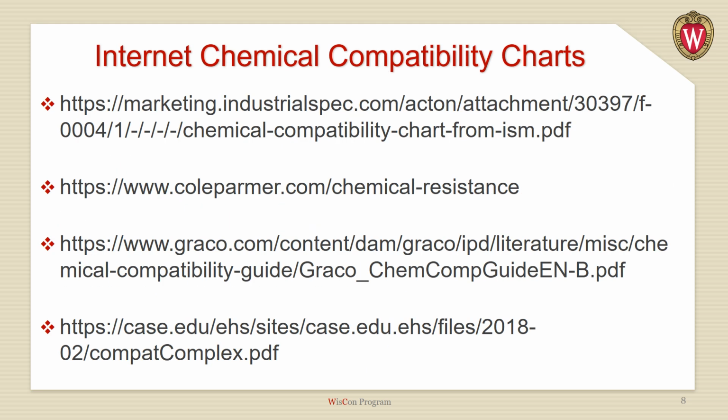This slide is the internet compatibility charts. These are charts of compatibility on the internet, and they're pretty good, but my favorite is the bottom one from Case University. It's very simple to read and gives a lot of information.